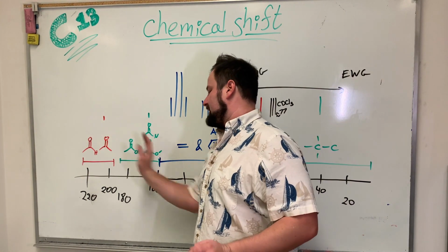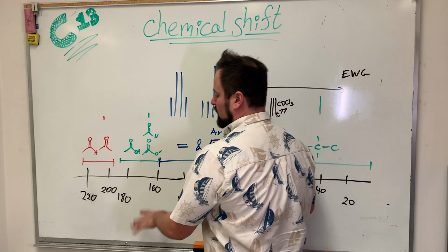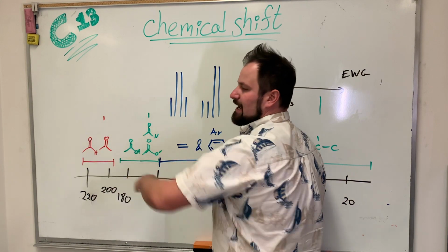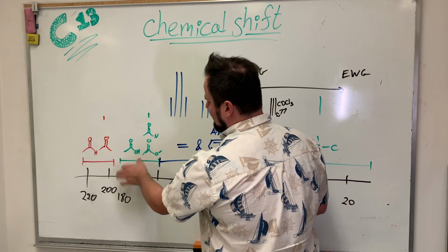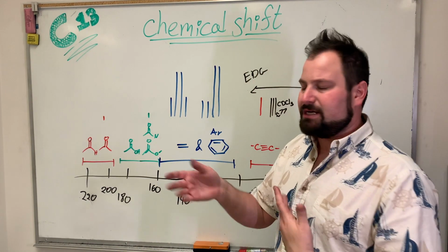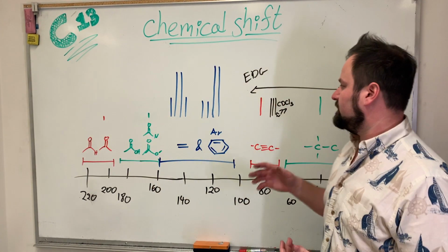And then for these guys, the really late ones, those are always tiny. So those are quaternary carbons. In particular, above 200, 200 to 220, those are aldehydes and ketones. And then 160 to 190-ish is where you have carboxylic acids, esters, amides, acyl chlorides, a variety of other things. And those are all, of course, tiny little things. You're not going to see much of them.